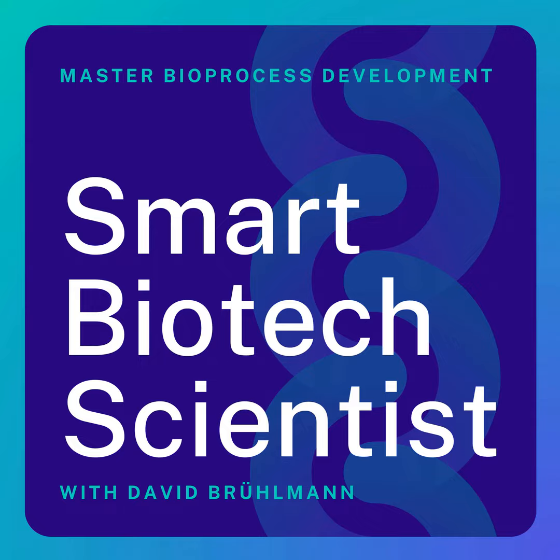Then today, in contrast to when I was doing this as a postdoc, there's also, of course, commercially available perfusion media platforms and perfusion-able cell lines that you can use as a starting point to then go into your own optimization. I think that's how I would approach it. So, smart biotech scientists, there are lots of good resources out there. I will put the link of the book in the show notes so you can go and find it. And also, there are platforms out there already. So you can start with something that already works and then you can tweak it. That's the idea behind that, Jochen.